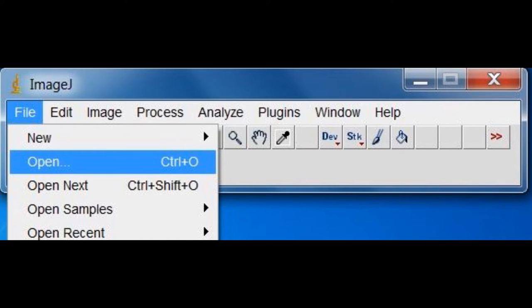First, open the ImageJ software, then to open your images with the software, go to File, Open, and find where the images of the desired particles were saved.